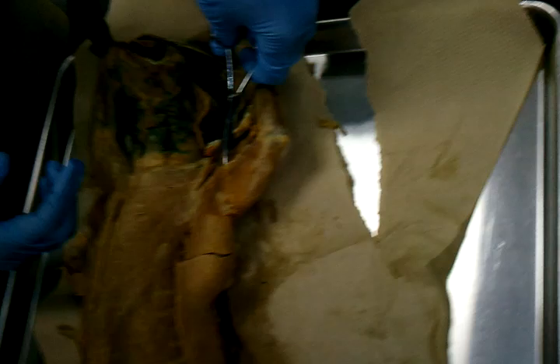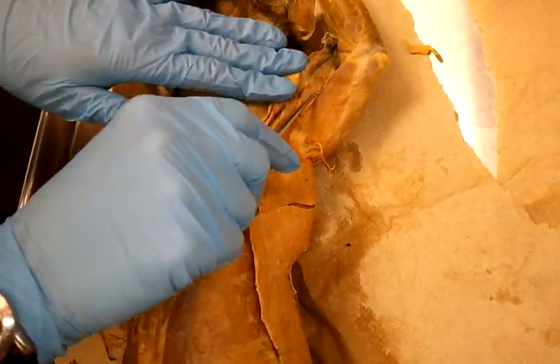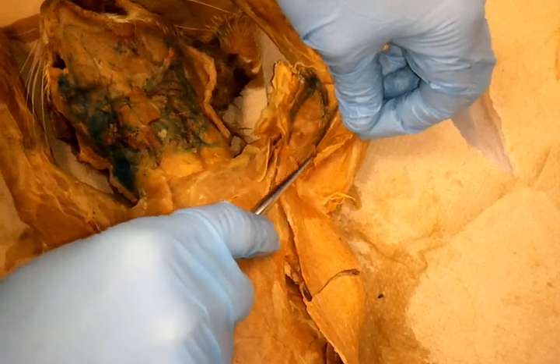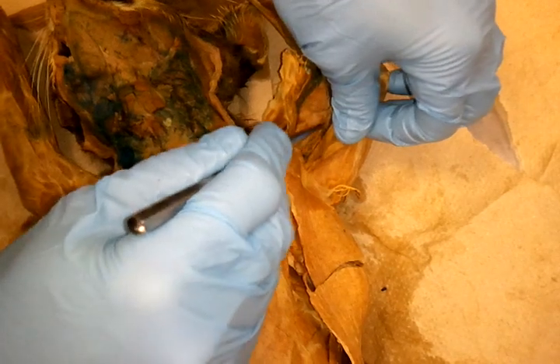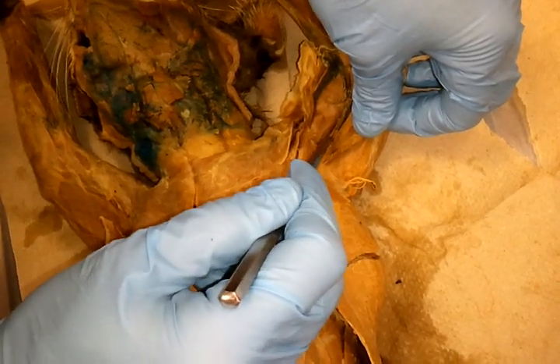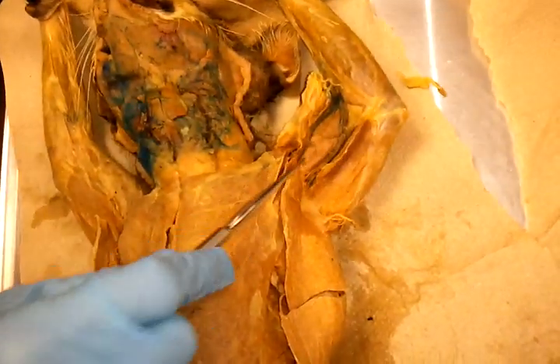Biceps brachii — this one is gold. So biceps brachii, it's anterior to your blood vessels that you'll see here. These are your brachial vein and brachial artery, and you're also going to have nerves in there. That's your biceps brachii.